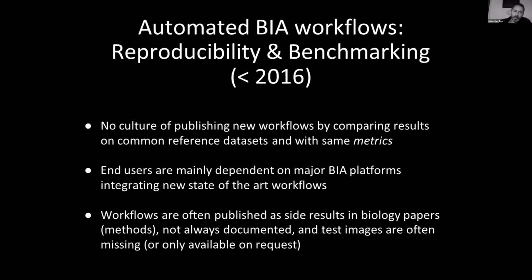And also the workflows, most of the time, were published as side results in biology papers, for instance, in the methods section, not always really well documented, and test images were often missing. So it was difficult, prior to using a workflow for our own images, to test it on images for which it was guaranteed to work. So all of this was missing.